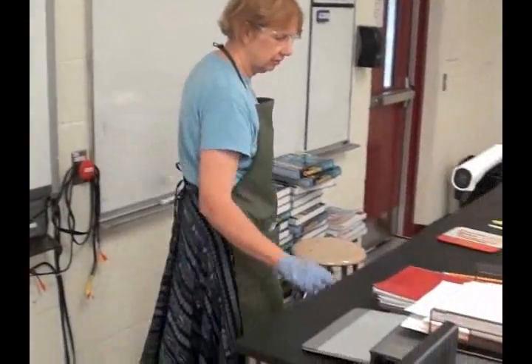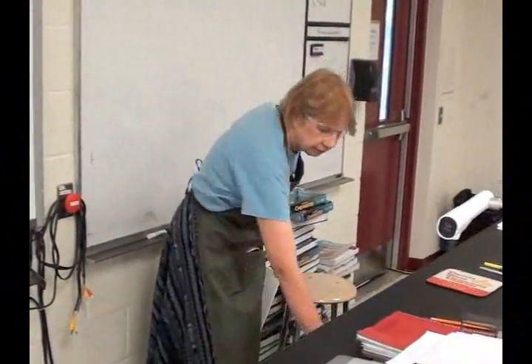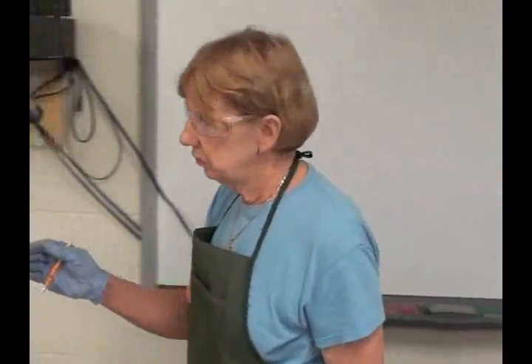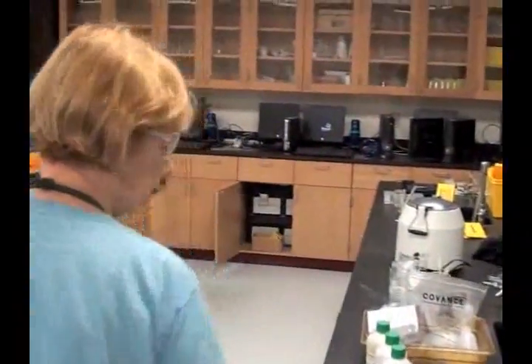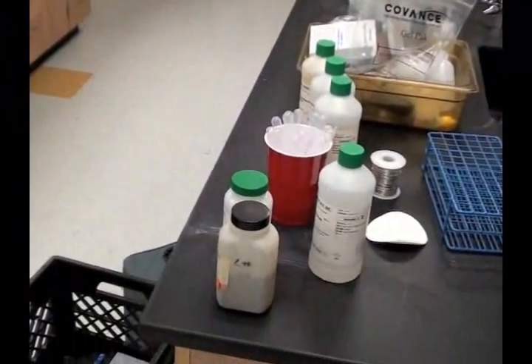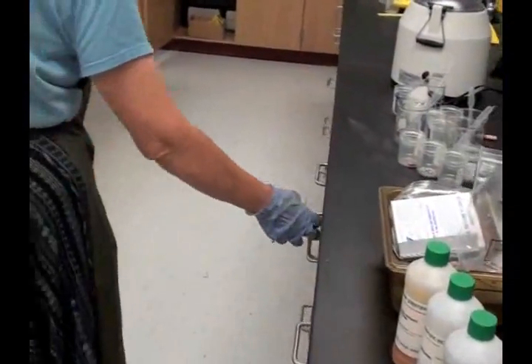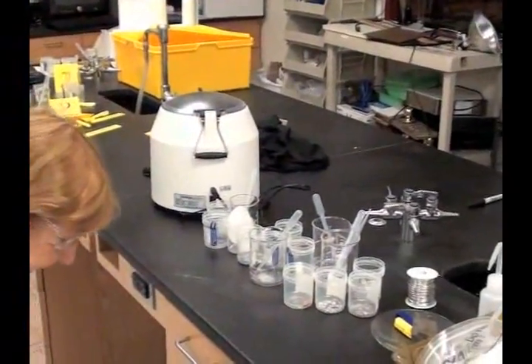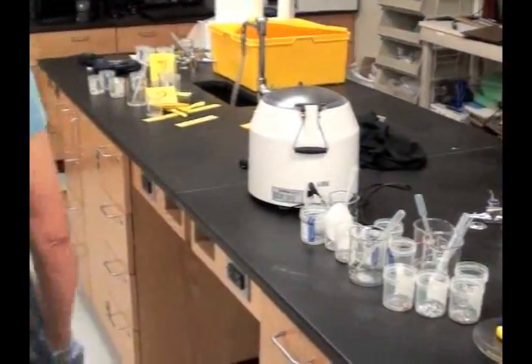You also need to look in the classroom to be sure there aren't any chemicals stored here. It's not a good idea ever to store any chemicals in a classroom. They should be returned to the storage area after the day's experiment. A common place you might find chemicals in the classroom is in the teacher's demonstration desk. So just go through all the drawers to make sure that something hasn't been put in there inadvertently and forgotten about. Also on the benches. They shouldn't be left on the benches after the experiment. They should be put away promptly. Put them away and then inventory them. And here again, look at all the drawers to see if some student has stashed something away where it doesn't belong. This can take a long time.